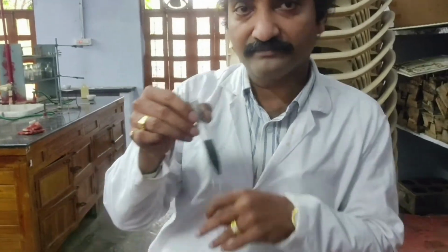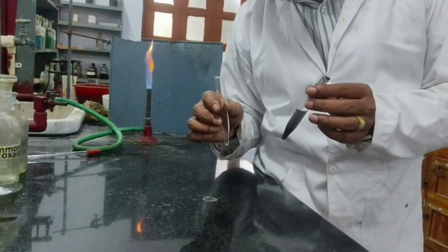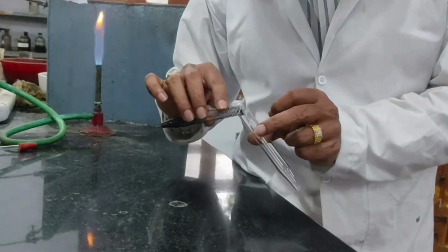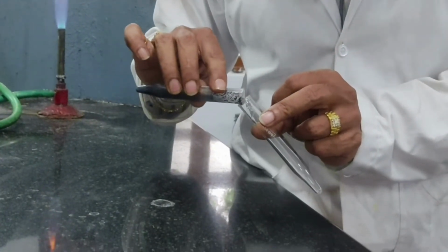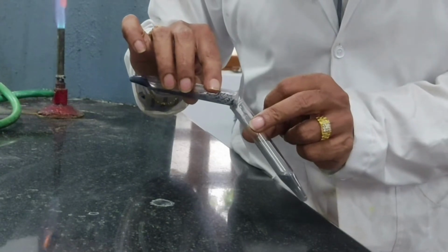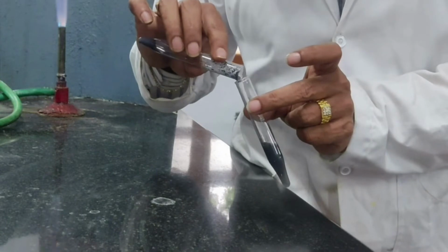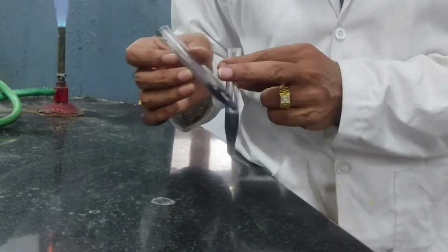Let us proceed. Now I am separating the residue from the centrifugate. I told you the residue contains Co+2 and Ni+2, whereas the centrifugate contains manganese and zinc. Now this is the residue I obtained.